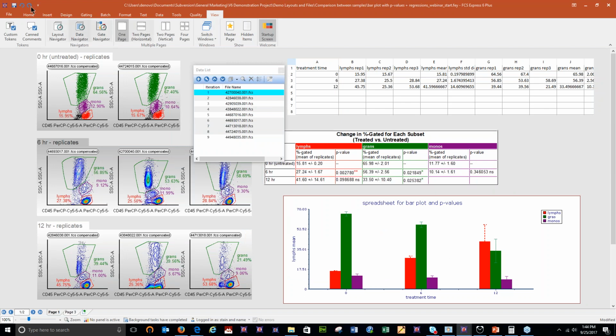Looks like I might have undid that. There we go. Okay, any questions? You can see that this p-value here in the lower right cell in my table is updating when I move my monos around. I can also move the control around, and it's updating as well.